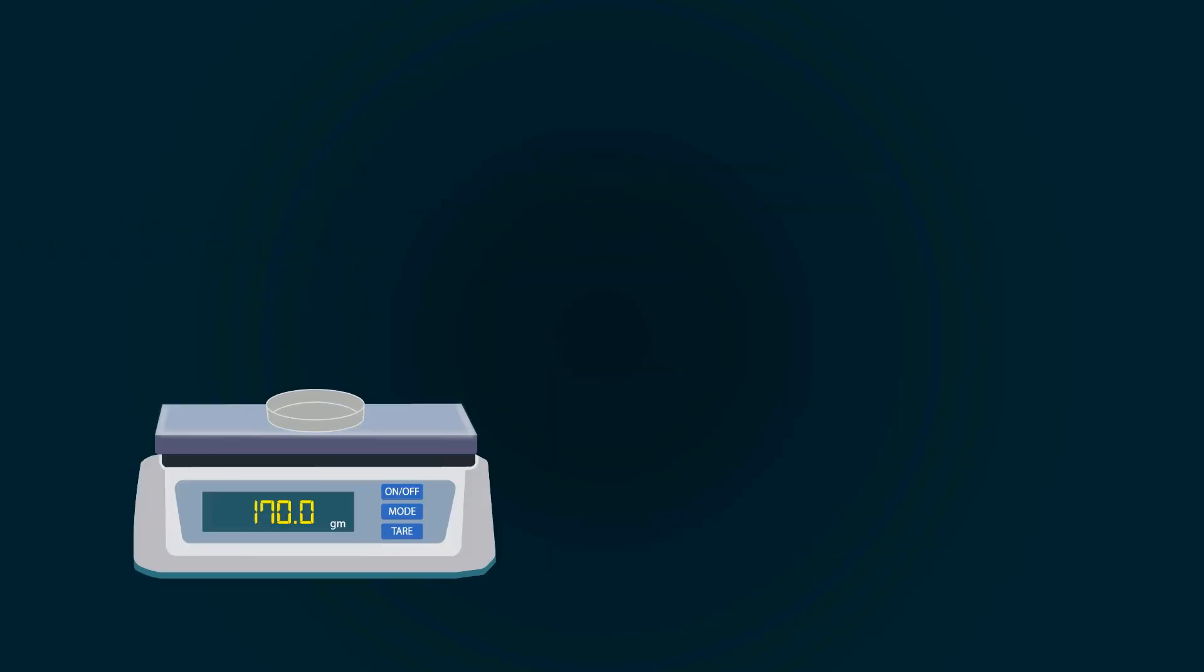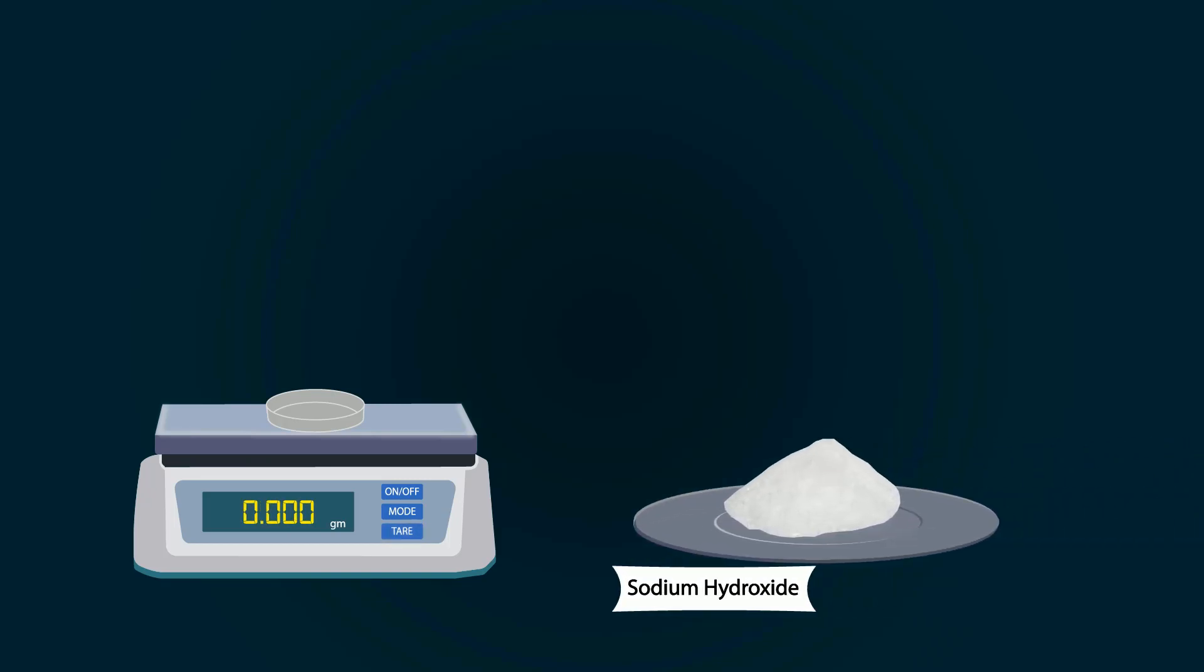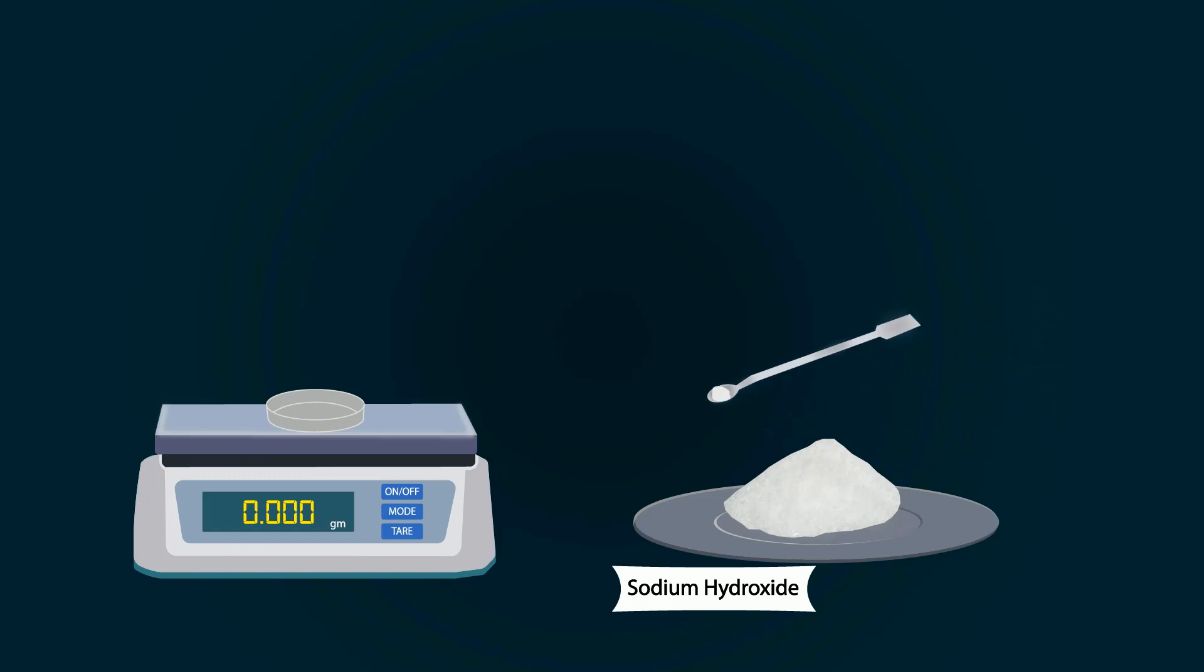Take another petri dish and put it on the weight balance. Tare the weight balance. Take NaOH chemical from stock bottle. Put this into petri dish with help of a spatula. Weigh precisely 4 grams.